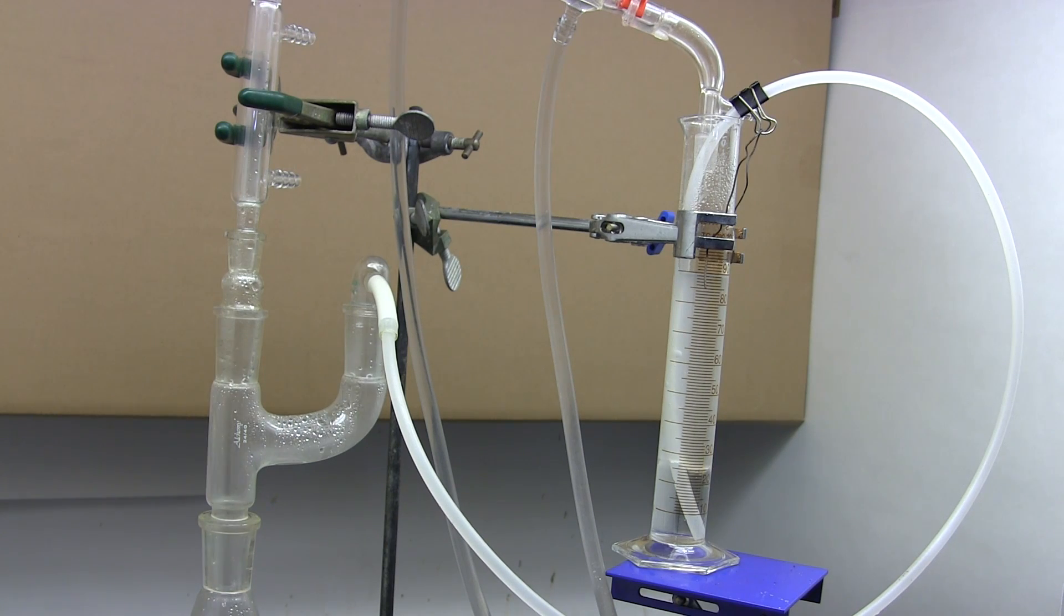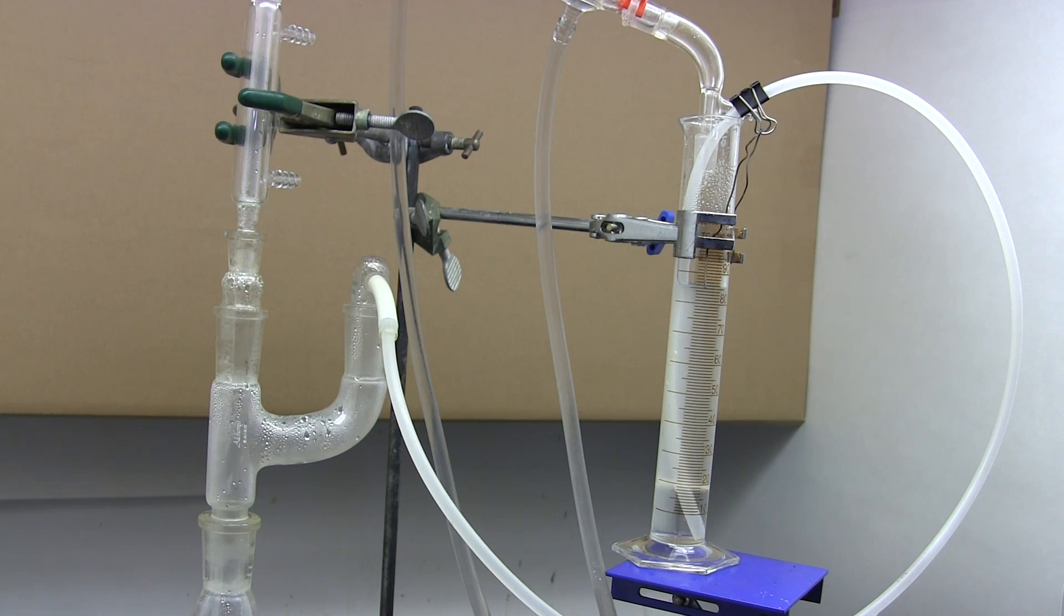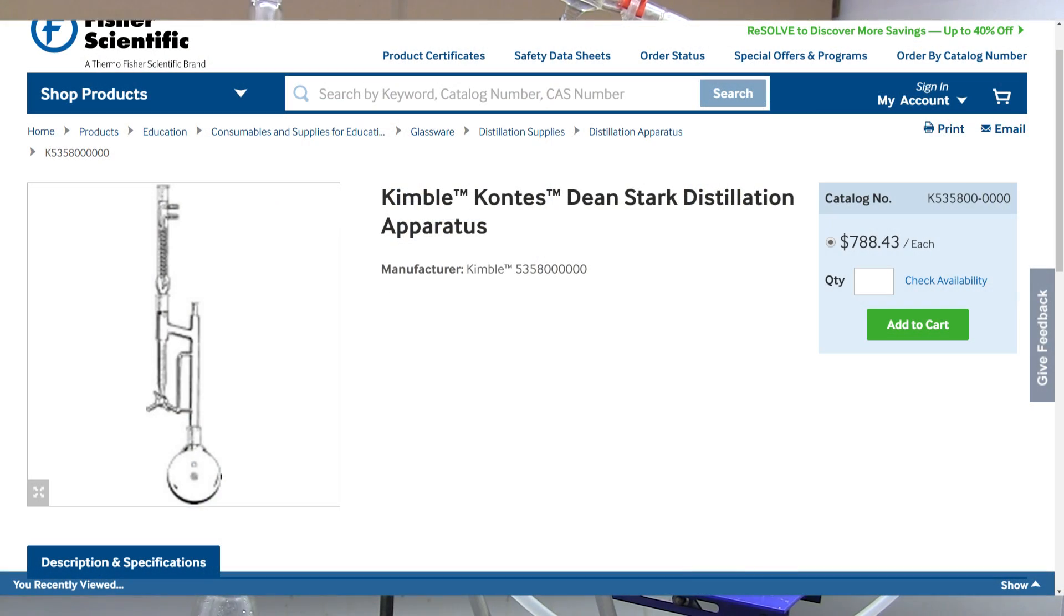So our homemade apparatus, despite being big, slow and ugly, can easily be converted to both light return and heavy return modes. A professional unit that can be converted to both modes is extremely rare and somewhat pricey. I don't do nearly enough distillation work to justify buying it.